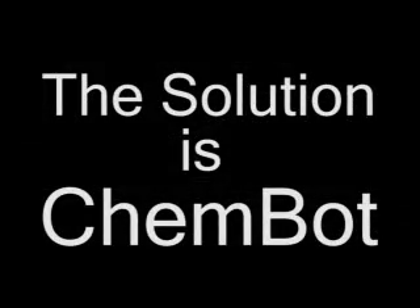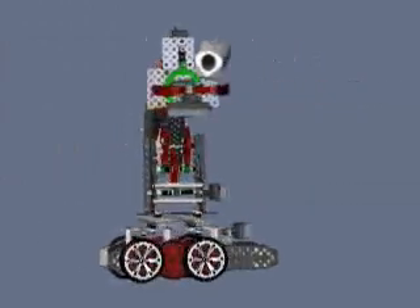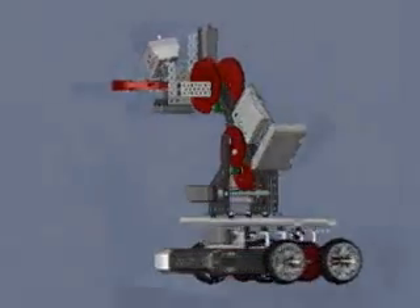The solution is ChemBot, a remotely controlled robotic arm mounted on a mobile base with a wireless video camera. Here is the SOLIDWORKS CAD model. This is the implementation of the design.